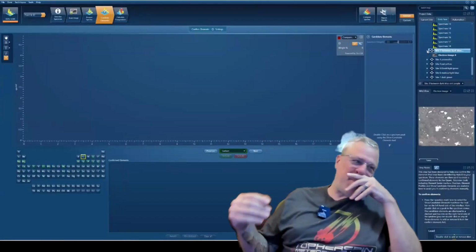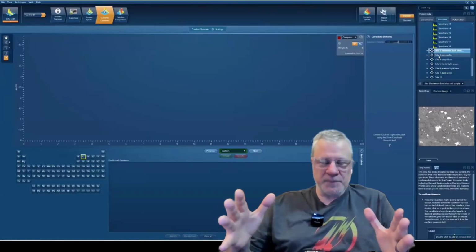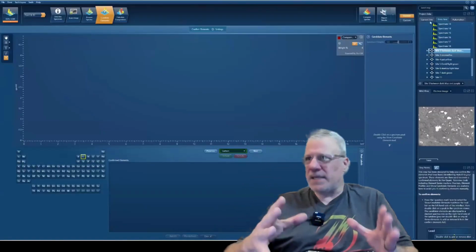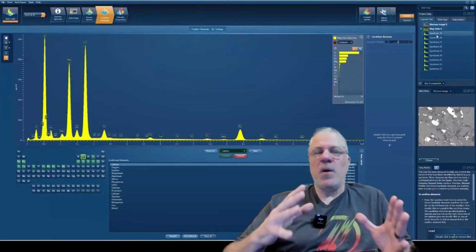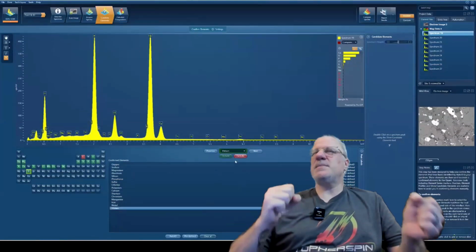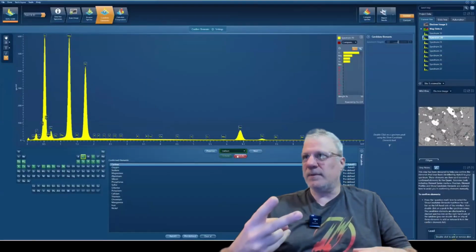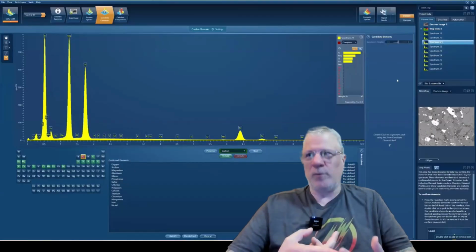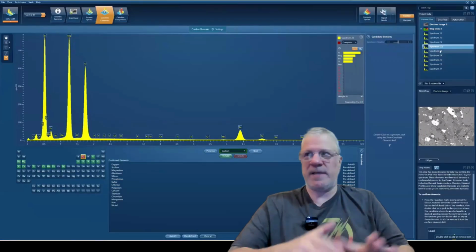I have a question about the gray scaling. You were talking about a 0 to 255 level, and the more metal or oxides, the lighter the color. What about free metals, or is this total metal? Because I know in a reading of a meteorite, you have two different metal contents, the free metal and the total metal. Can you talk to that and what we're seeing and how it's displayed in these grayscales, if we can see that?